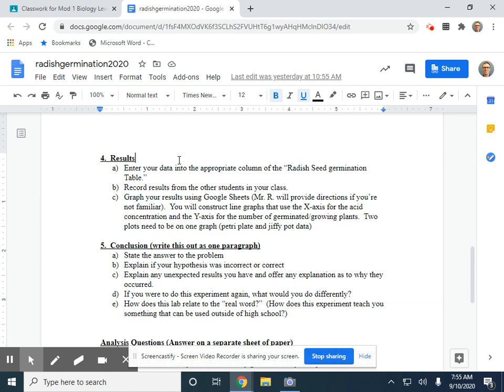Okay, so guys, that's how you set up the lab. Like I said, nothing really too technical. And once you're done with this, you can go over and double check the assignments are going to be due, and then we'll have our Google Meet session. Okay, and you can ask me any questions you want about what you had just set up.